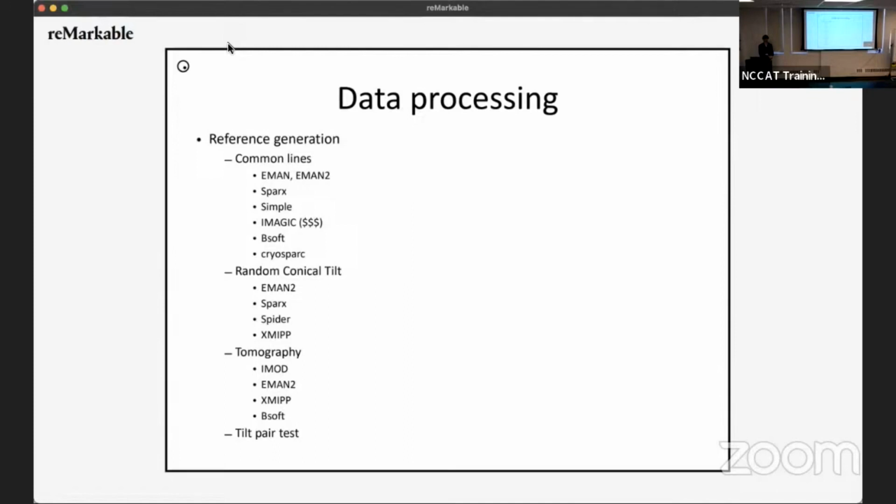Now, you don't want too many classes, because I read some things about that. The optimization tends to fall apart when you start to have too many classes. Fred would probably know more about that than I do. So somewhere between 50 and 100 or 200 classes is what you want to shoot for, depending on the size of your data set.